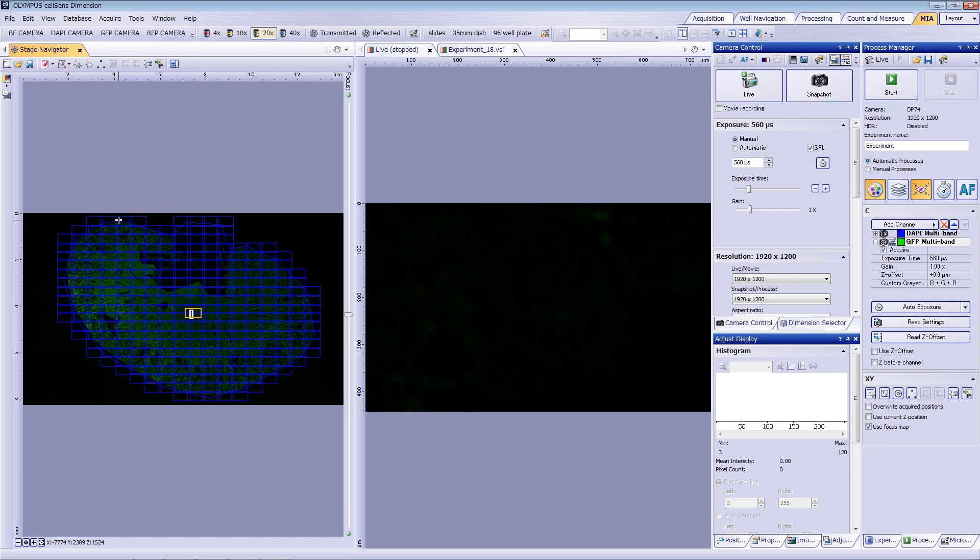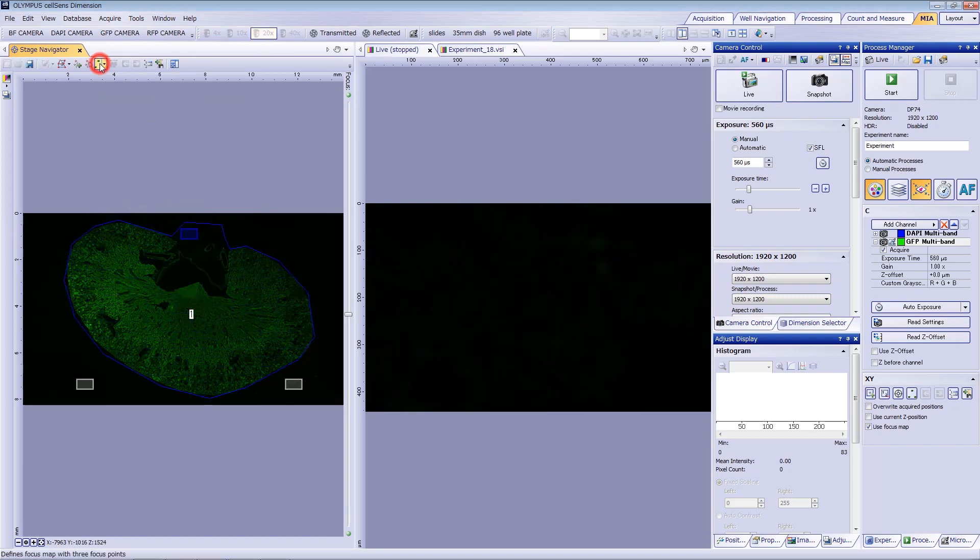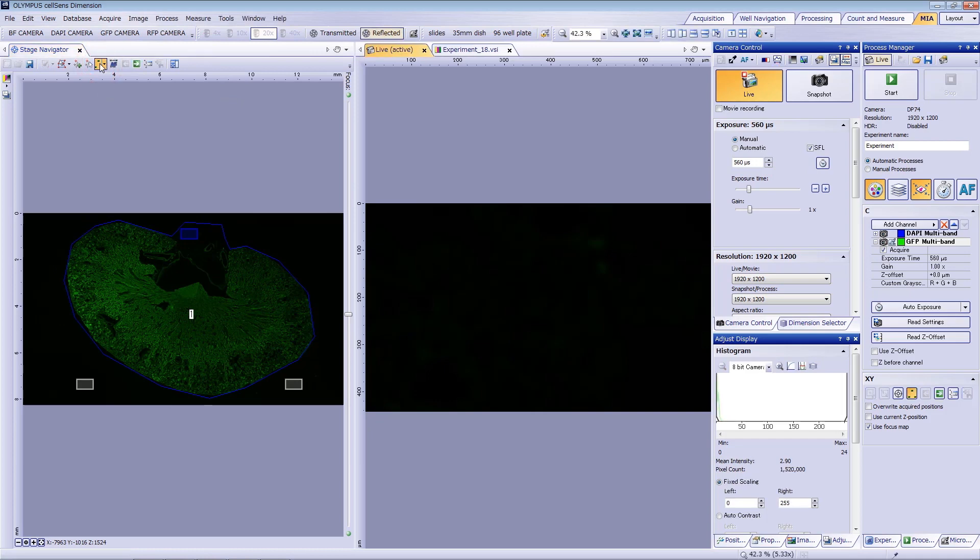Once complete, create a focus map by clicking on the icon. When imaging large areas of tissue, a focus map is useful for compensating for the sample's tilt.